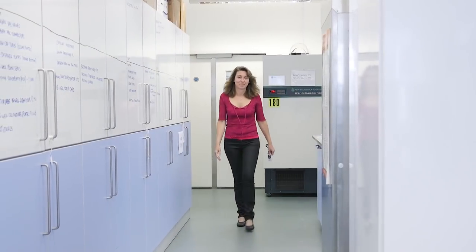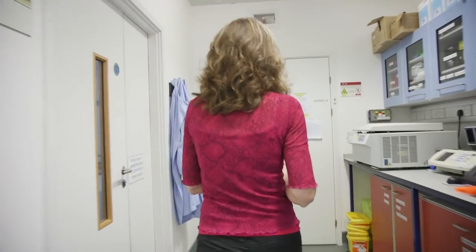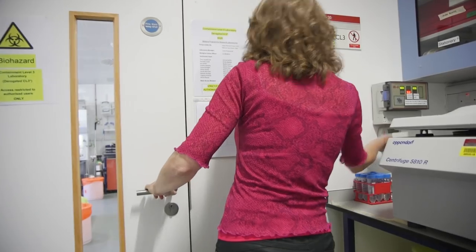Malaria parasites are infectious organisms, so in order to work with them we need a special lab. These are CL3 or containment level 3 laboratories.